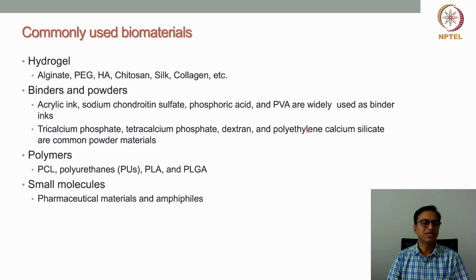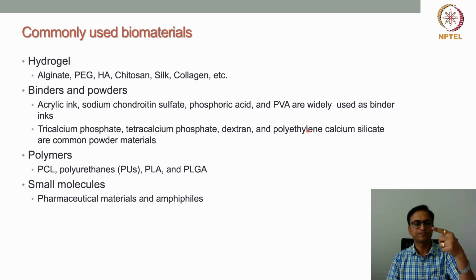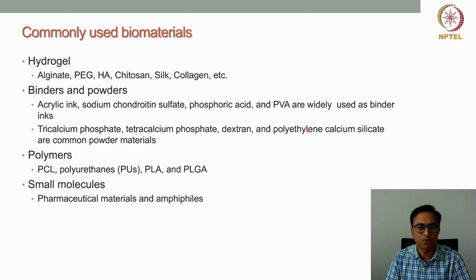Then the same phenomenon applies, where these polymer solutions are loaded into the cartridge. From the cartridge, it will reach the nozzles, and from the nozzles, based upon either thermal or piezo actuation, the droplets will be generated, and then these droplets are plotted. Now, when we use polymer solutions, if it is an organic solution with a volatile solvent, then the solidification process is much easier, because after printing the solvent can be easily evaporated, and then we can get solid particles or a solid structure.